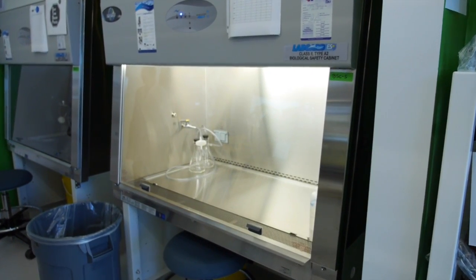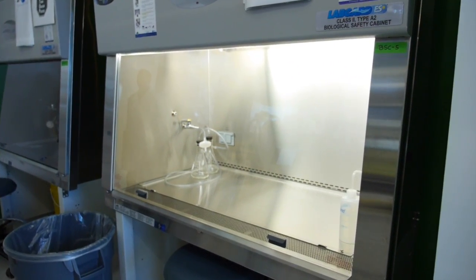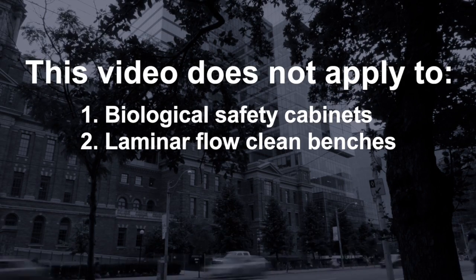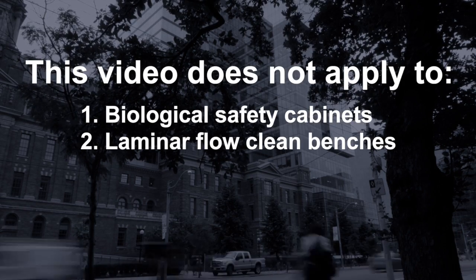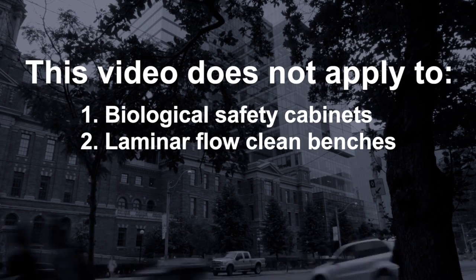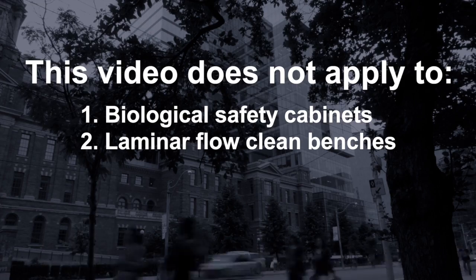This video does not apply to biological safety cabinets or laminar flow clean benches. Biological safety cabinets and laminar flow clean benches are sometimes mistaken for fume hoods. These devices utilize particulate filters, which do not remove chemical vapors.